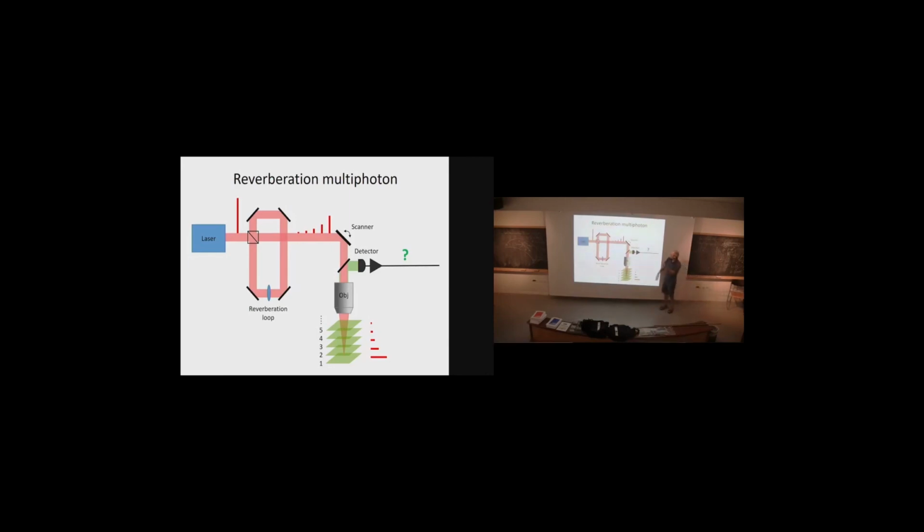Now you might say there's a problem here because I don't have the same power per pulse. And you might ask, well, what am I going to see with this system if each pulse has a different power? Well, I haven't taken into account the fact that I'm looking in scattering media. In scattering media, again, this is a multiphoton microscope, only the unscattered light generates signal. So to look deep, I need a lot of power to generate the same amount of signal as if I look shallow. So this actually adjusts the power automatically.